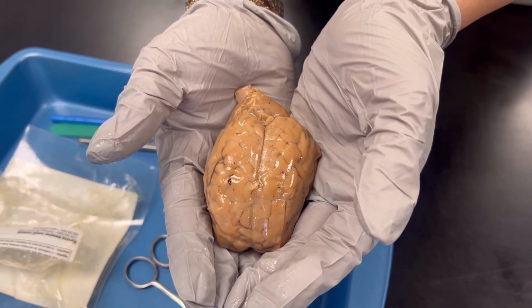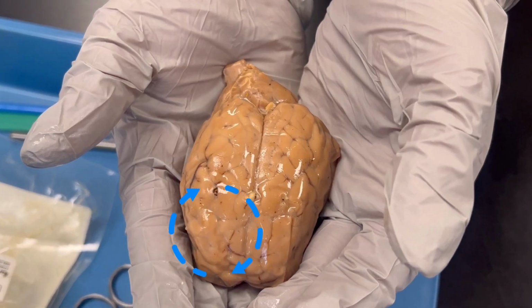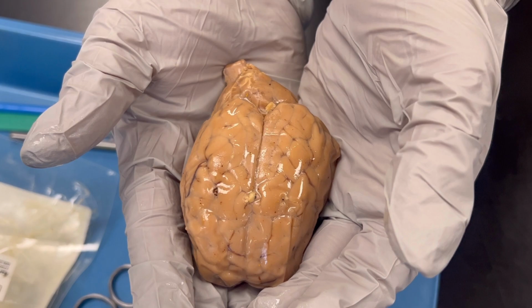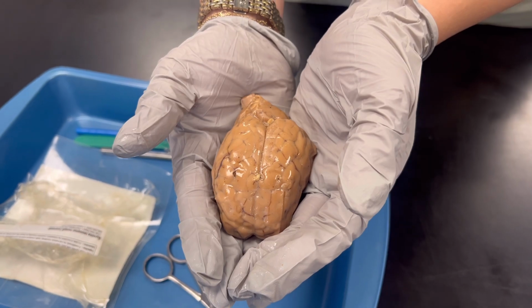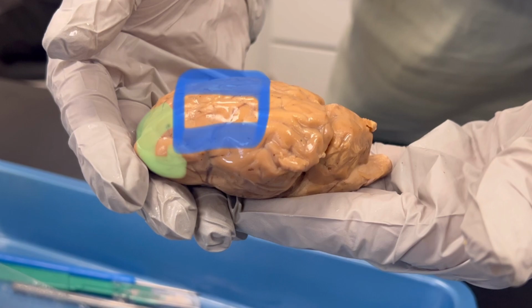With that being said, let's go to our first checkpoint, which is the external anatomy of a sheep's brain. Right here, we can see the pia mater, the right and left cerebral hemispheres, gyri and sulci. Gyri are the bumps and sulci are the grooves. And then this one is the longitudinal fissure. If you are familiar with the bones of the skull, then this should be a breeze, because they both have the same names: frontal lobe, parietal lobe, temporal lobe, and occipital lobe.